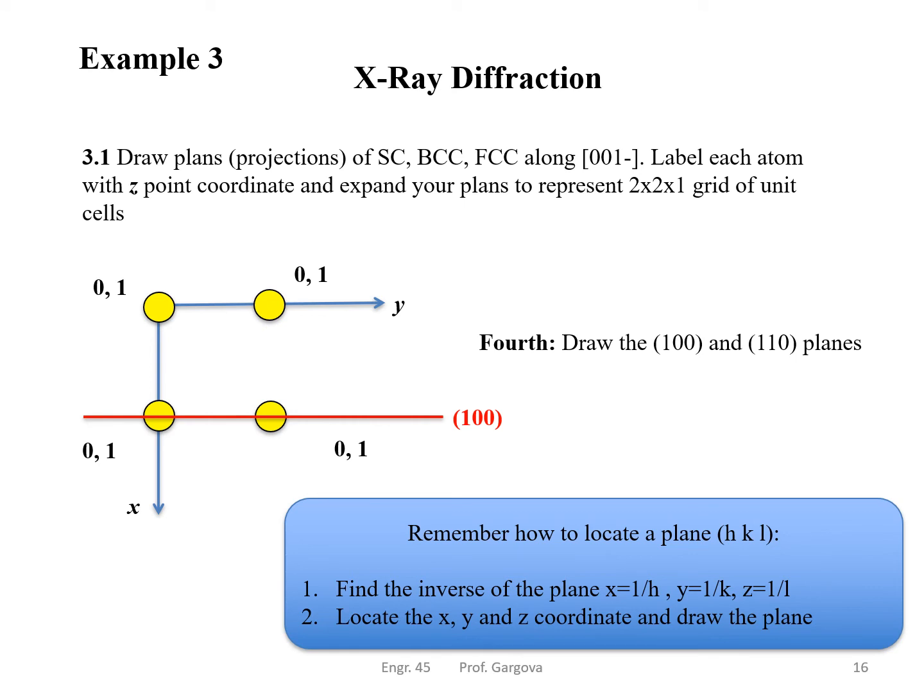So it looks something like this, where the plane at 1, 0, 0, if we were to draw, is always on the Z axis, and if we were to draw lines going down, since it's coming towards us, the plane will always be touching the Z and the Y axis, and it's 1 over in the X direction.